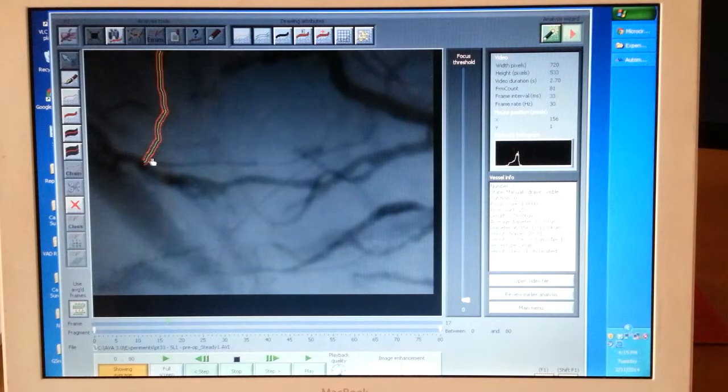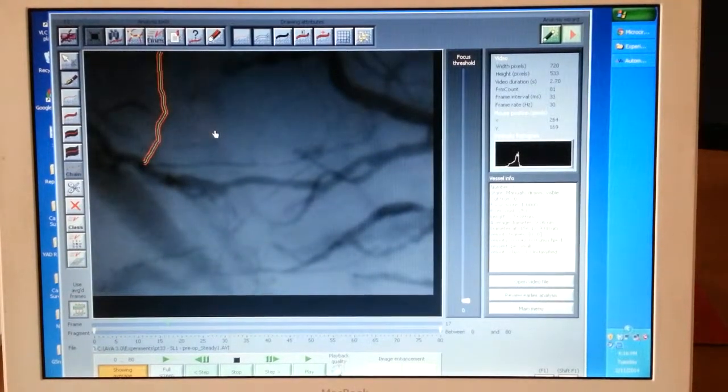as you slide the mouse further out from the center line, you will be able to adjust the thickness, okay? And once you think that the thickness is approximately correct, you click again, and it'll keep that vessel in there. So you see, just in one shot, I've drawn this vessel as opposed to having to use that thing and draw multiple chunks. I just think it's easier, okay?